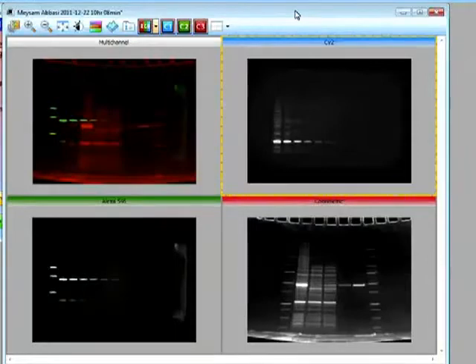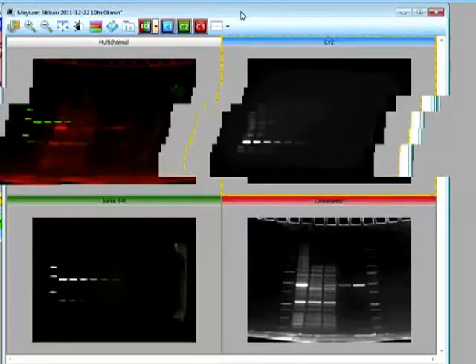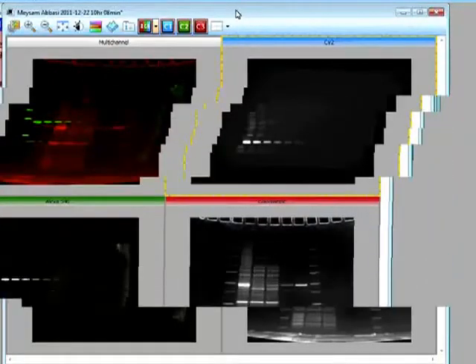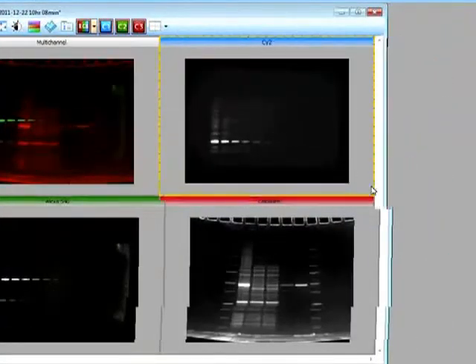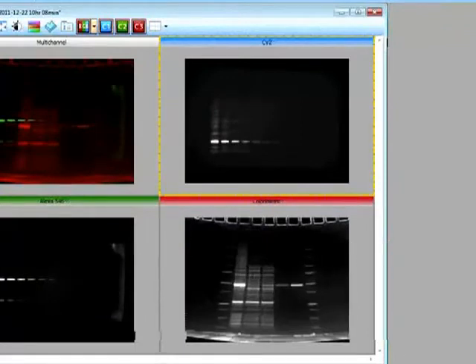So this is how easy it is to take an image for multi-channel protocols.